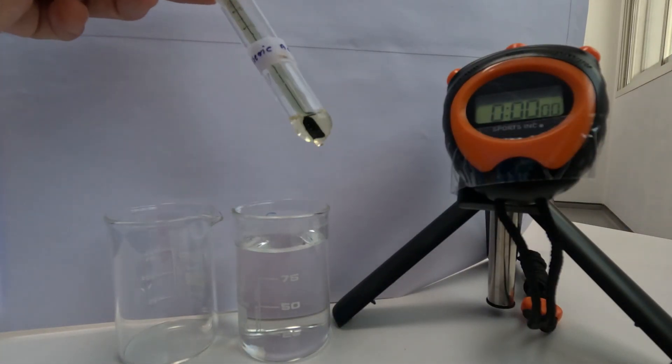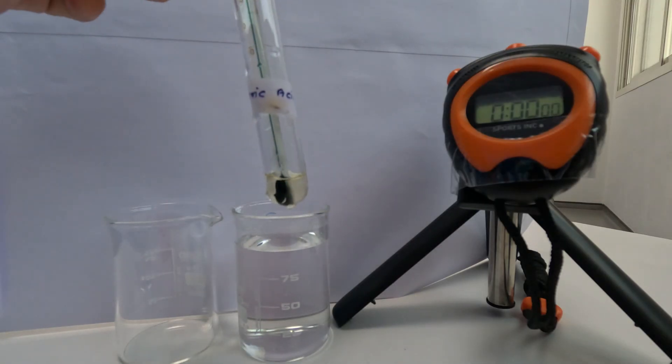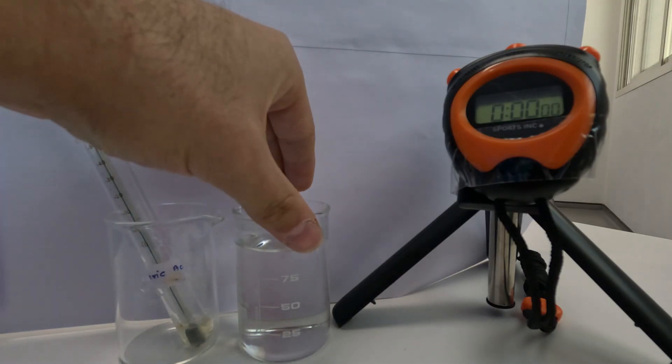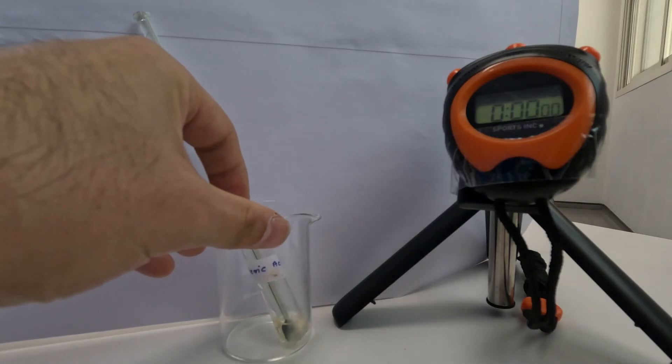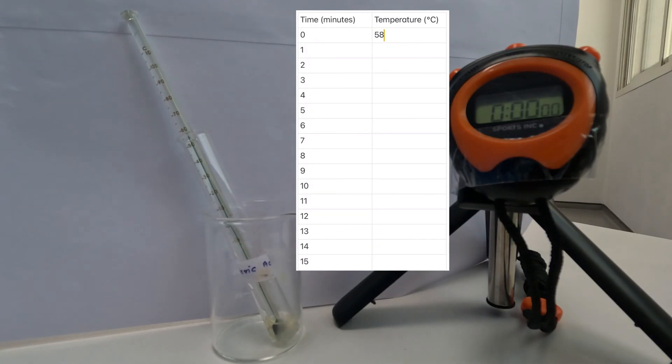As you can see, all of the stearic acid has turned into liquid, so now I'm going to remove it from the hot water and put it into the empty beaker. I'm going to record the temperature now at zero and then start the stopwatch.